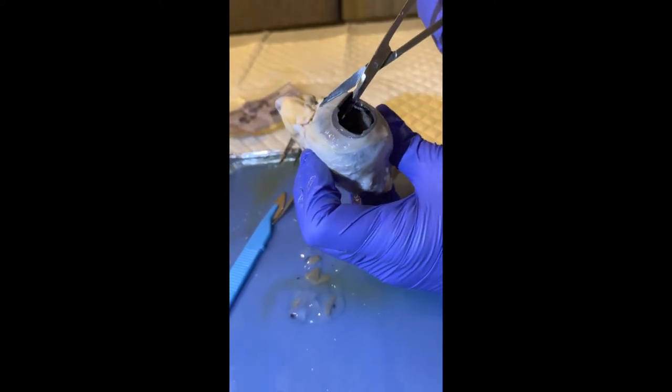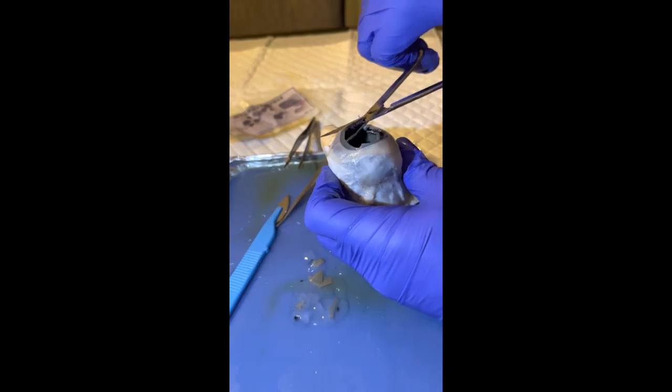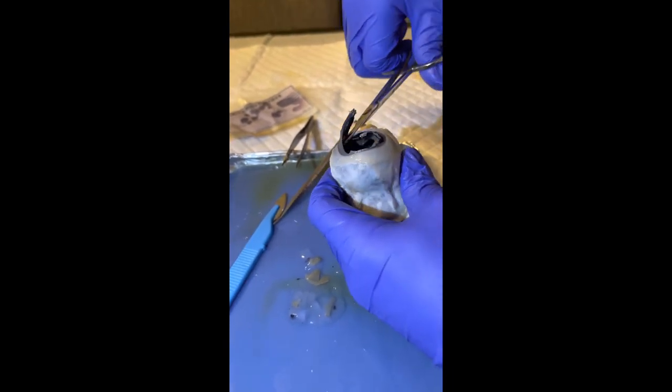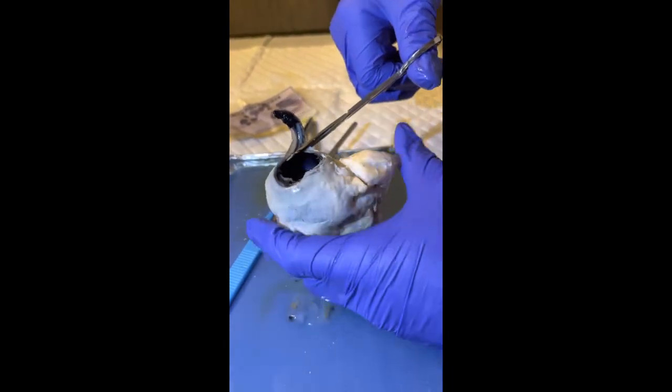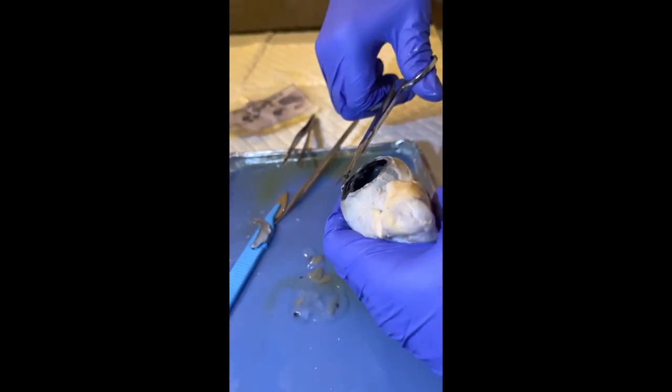After dissecting further, I was able to come across the optic nerve and retina being attached completely. This is where the optic nerve begins to collect all vision data, eventually sending those signals to the cow's brain.